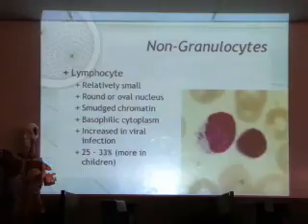One of the functions of the lymphocyte, remember, is to make antibodies, right? And antibodies are protein, yeah? So in order to make proteins, what else do you need? You need the ribosomes, right? And ribosomes like methylene blue. So if the cell is actively making a lot of proteins, the cytoplasm tends to be very blue. Basophilic cytoplasm. Okay? But some lymphocytes may not have a lot of ribosomes, so they don't stain that blue.